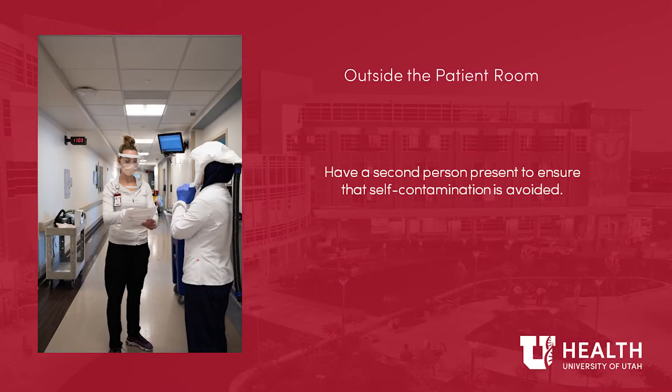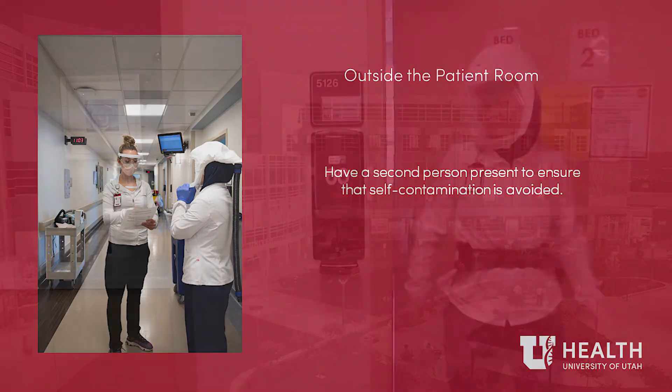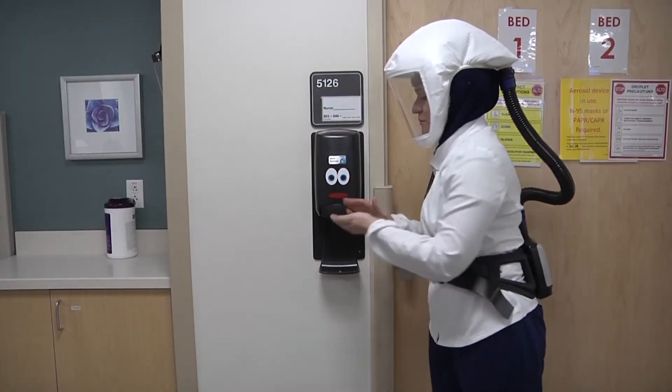Outside the room: have a second person present to ensure that self-contamination is avoided. Perform hand hygiene and put on new gloves.